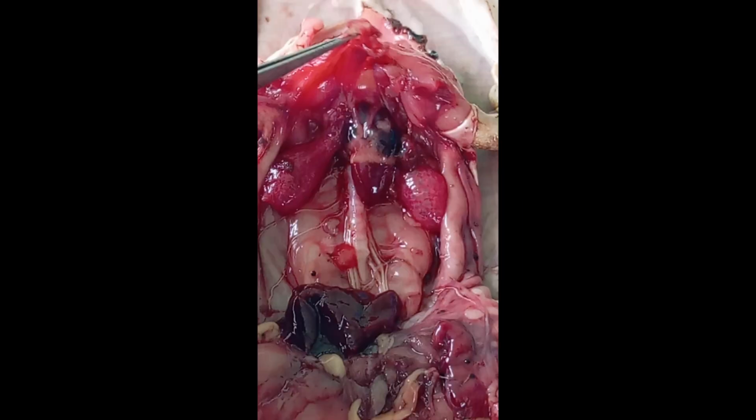Welcome. We want to show the thoracic cavity of toads. It's a specific area in the ventral body cavity covered by the heart with its blood vessels and the lungs. Even though the thoracic cavity is not cut off from the abdominopelvic region by a diaphragm as in mammals, it's a clear zone. Part of it is demarcated from the throat and the buccal cavity. So it's a clear area.